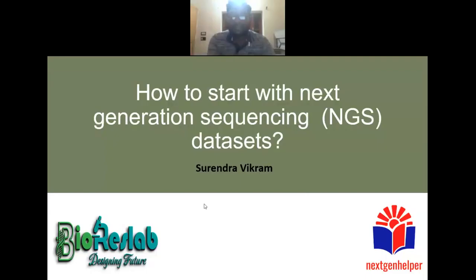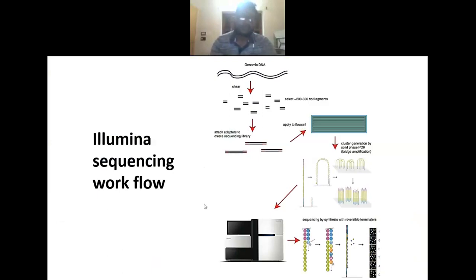Some introduction or basics here: we are going to use the next generation sequencing data that is produced from high throughput sequencing platforms. And as I use the term high throughput sequencing platform, they can also incorporate errors in the sequences we get out of the platform. So there is a need to first analyze the raw data which we receive from the sequencing platforms.